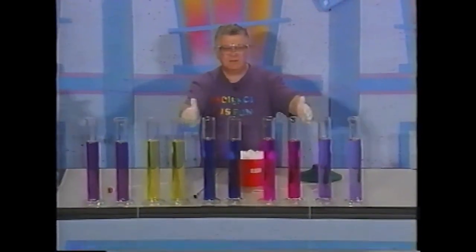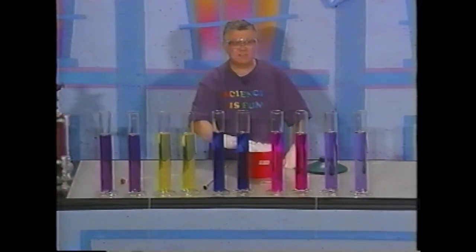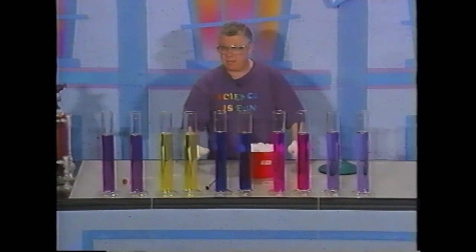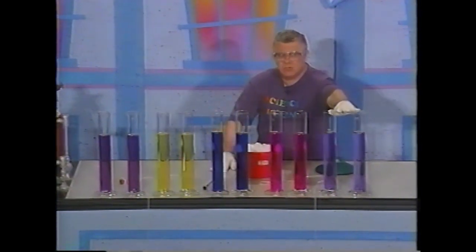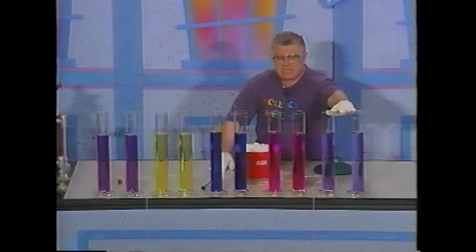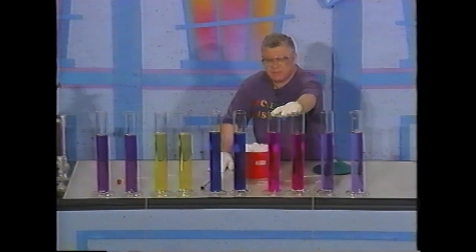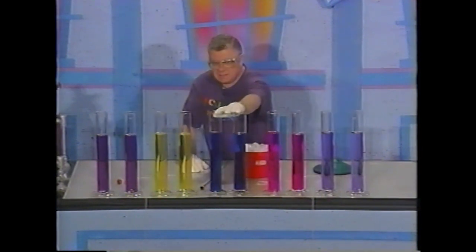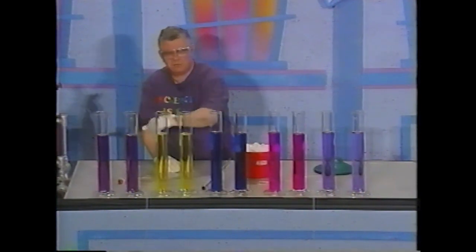How many cylinders are there in front of me? And are they arranged in some kind of pattern? Do they have a pattern to the arrangement? Can you see? Yes? You can see that 2 cylinders have the same colored liquid in them. Over here, again, another pair with the same colored liquid. This is a third pair with the same colored liquid, a fourth pair, and a fifth pair.